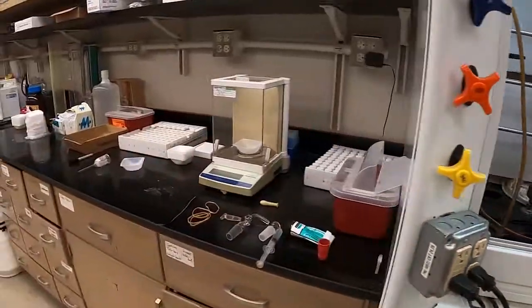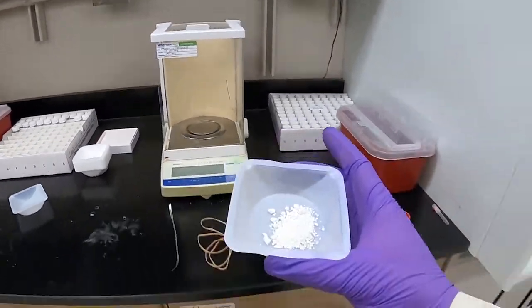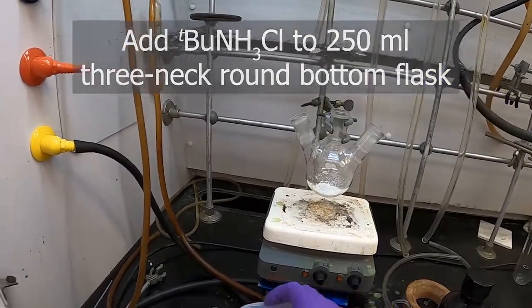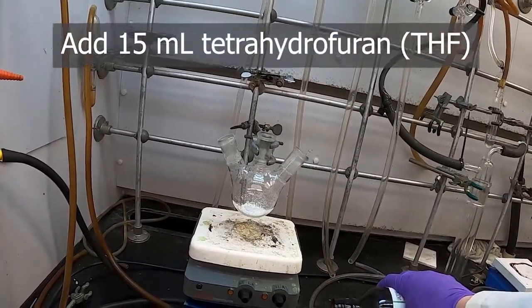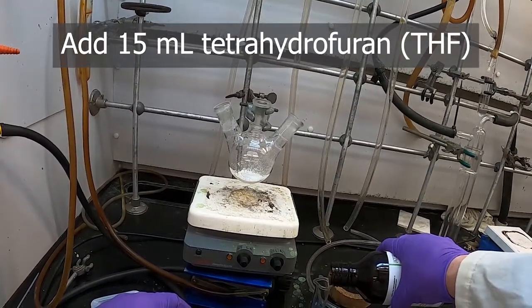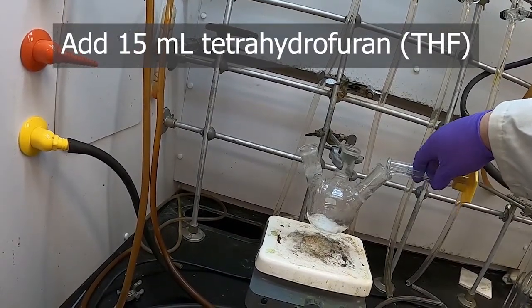The first thing we're going to do actually is, I've got our 3 grams of tert-butyl ammonium chloride right here on the balance. So I will take that over and go ahead and put that in our flask, along with 15 milliliters of THF. Use that to kind of rinse some of the powder out of the joint.